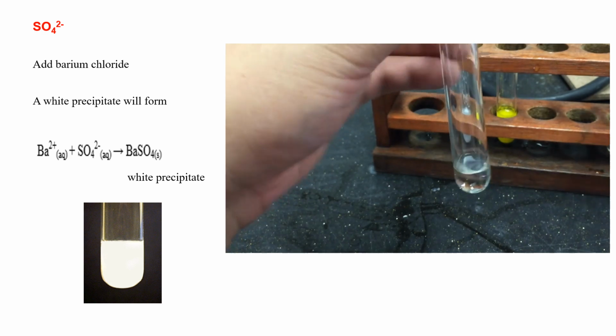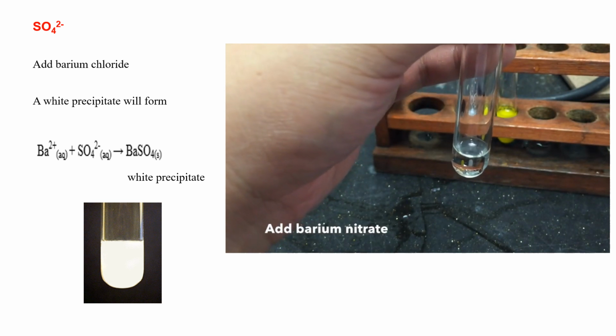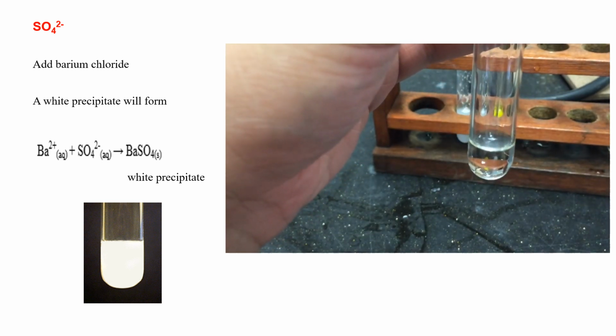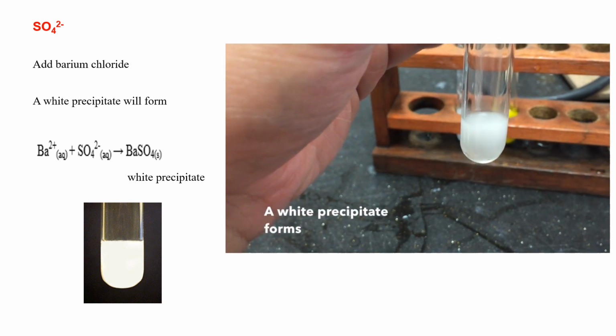Proceed to add a few drops of barium nitrate. You will see that a white precipitate forms immediately.